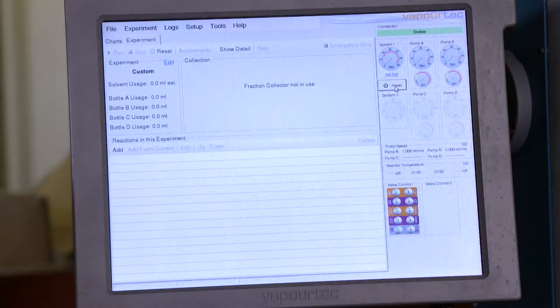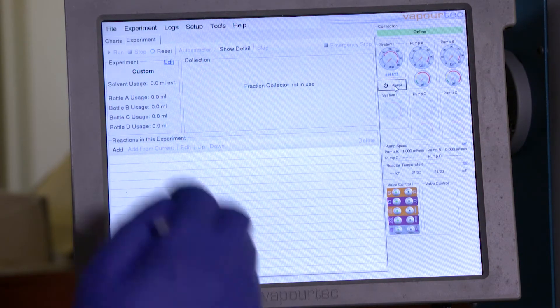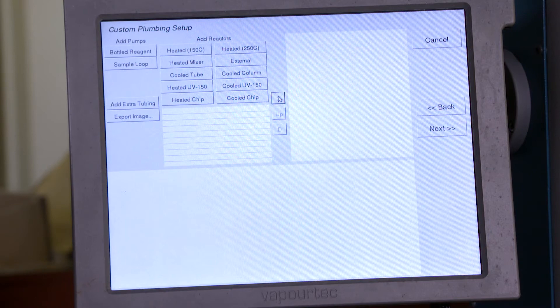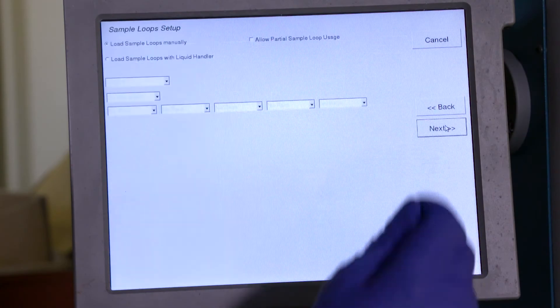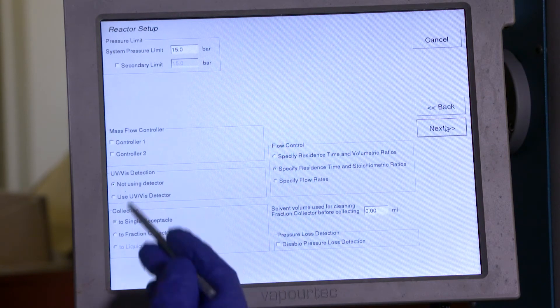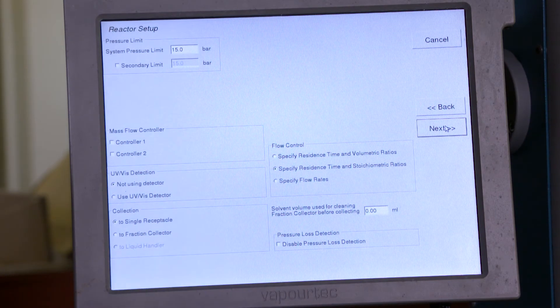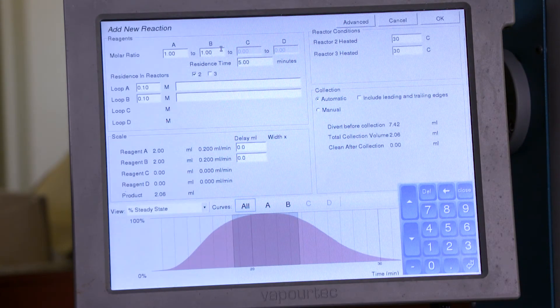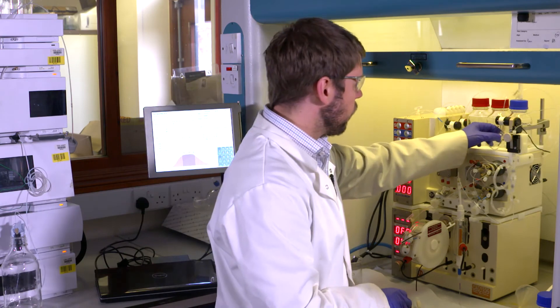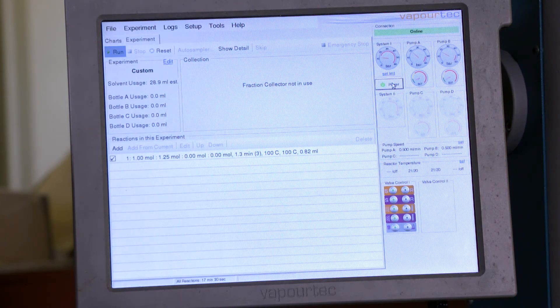I load the other loop in exactly the same way. Now my reactor is ready I can use Flow Commander to program my experiment. This page allows me to create an electronic record of the work that I'm doing. On this page I tell the system what I'm using. On this page I can specify the system pressure limit, whether or not I'm using any kind of detection, and how I would like to collect my product. Now I can program the reaction. Flow Commander is able to collect my reaction product so I'm going to put a vial under the collection valve. Before I run the reaction I'm going to run with some solvent for a few moments just to make sure I get rid of any extra air that may have got in while I was opening and closing fittings. Now the system is full of solvent I'm going to start the experiment and let Flow Commander take over.